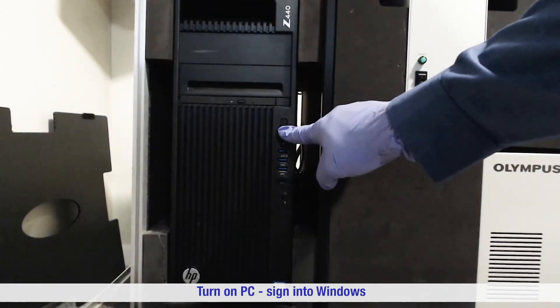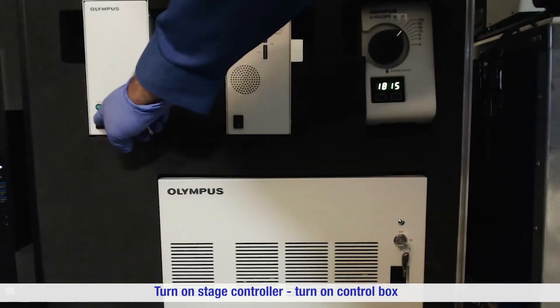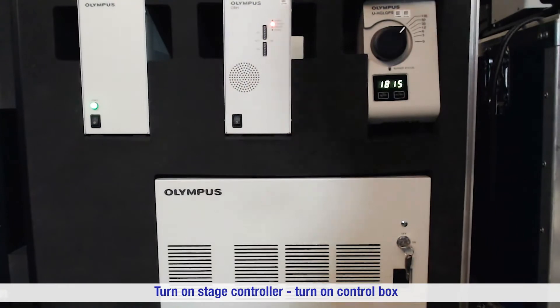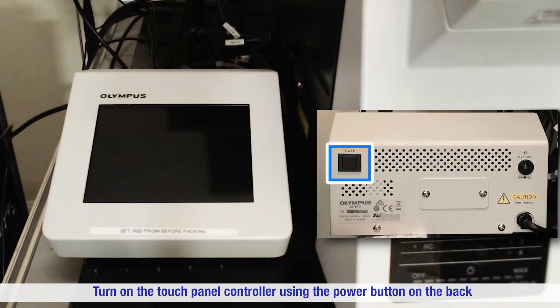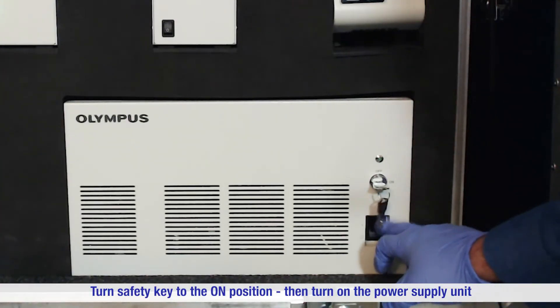Turn on the PC for the FV3000 microscope and sign into Windows. Turn on the stage controller and then turn on the control box. Turn on the touch panel controller using the power button on the back. Ensure that the safety key is in the on position and then turn on the power supply unit.